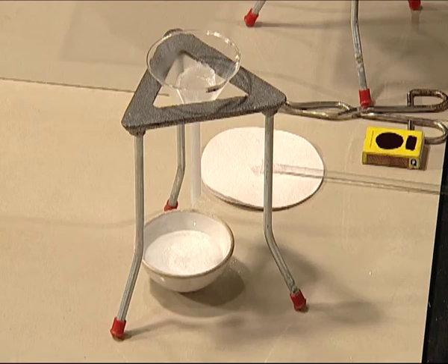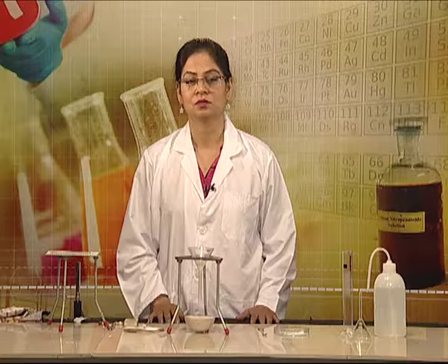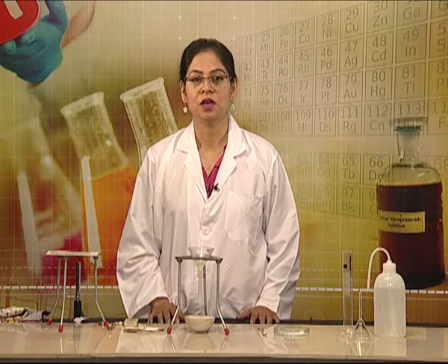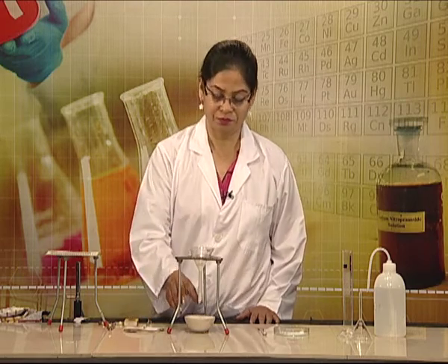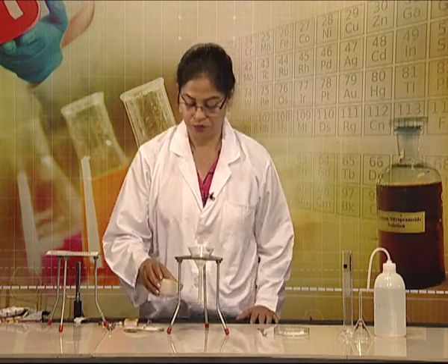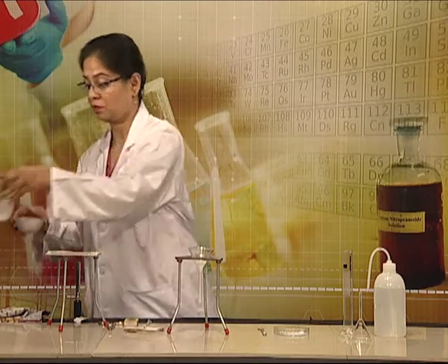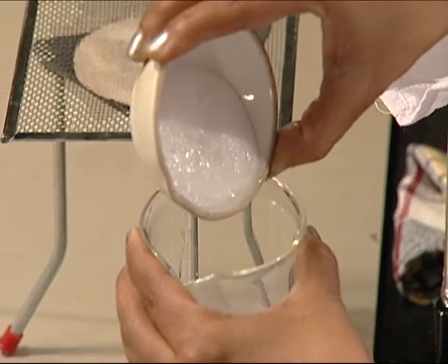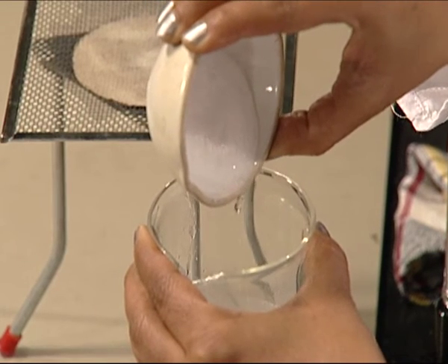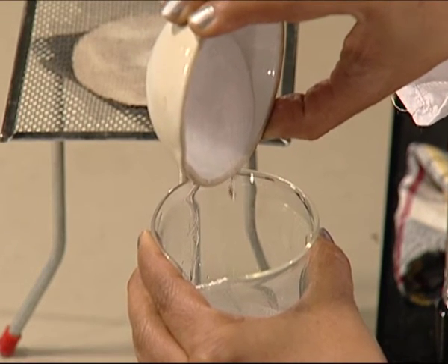Keep the solution undisturbed for cooling. When the crystals are formed, remove the mother liquor by decantation. As you can see, crystals of benzoic acid are formed.